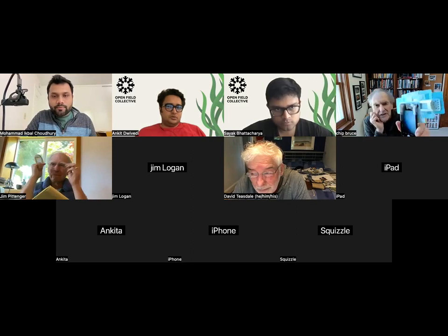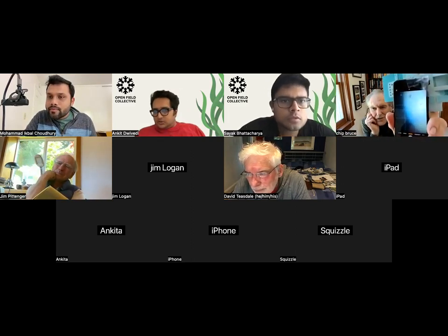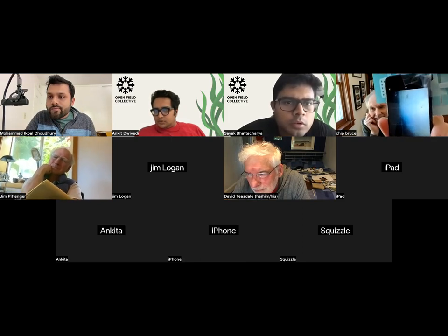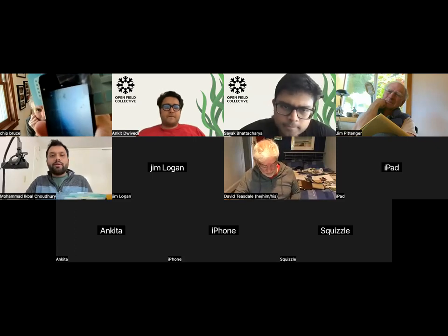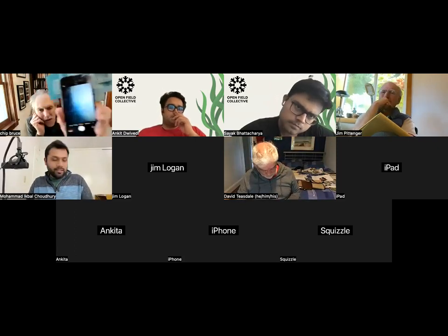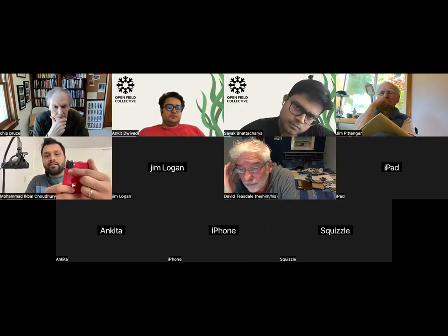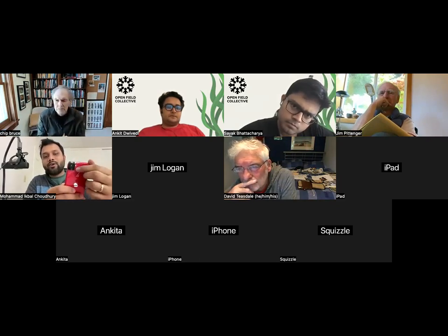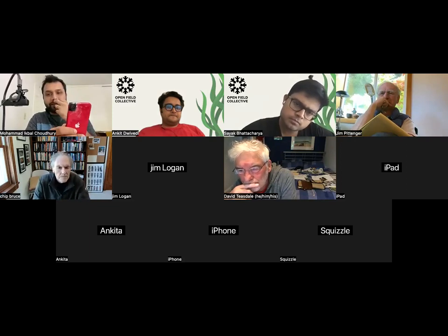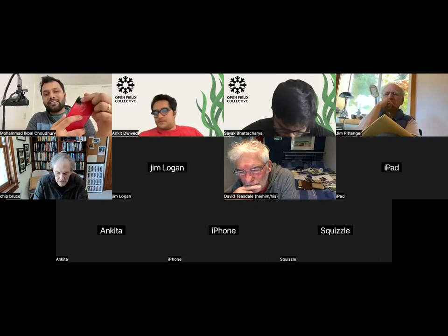So, quick question. I'm getting images like that. Is that just a focus problem? Is that something I need to fix? So yeah, I can see stuff is there. The problem that Bruce is showing here primarily appears when you don't have this piece properly connected here. It is offset a little bit, and that causes that alignment issue. So I think it just takes a bit of practice.